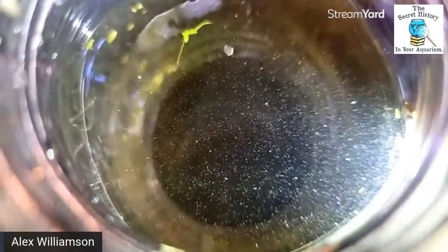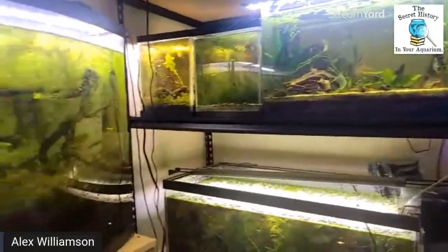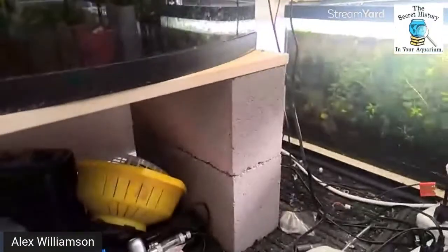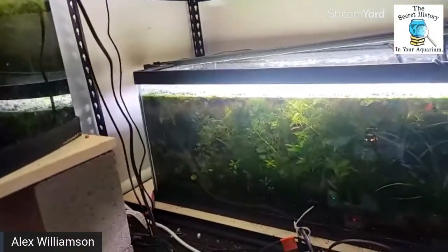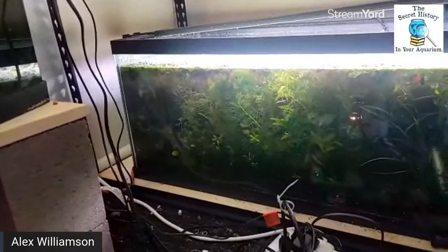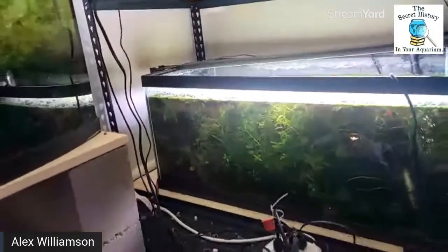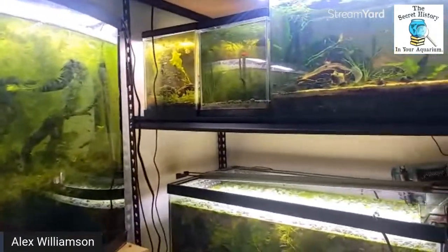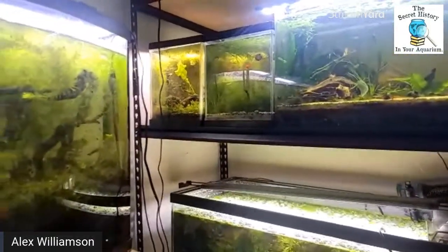But why don't we try to get some of those? Or you guys tell me which tank you guys want to see something from, and we'll take a sample from that. Whichever you want, we'll do. I got a whole box of slides fresh here that I bought the other day. And I think they were like $20 for like 50. So it was a pretty good deal for good quality slides. I didn't get slip covers because they just annoy me when I'm looking for critters, as I said.